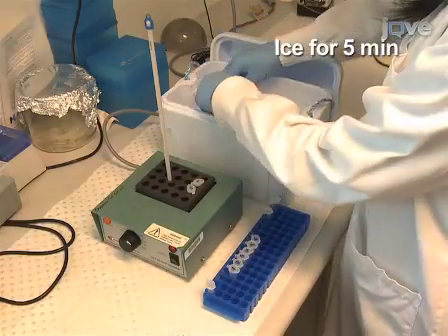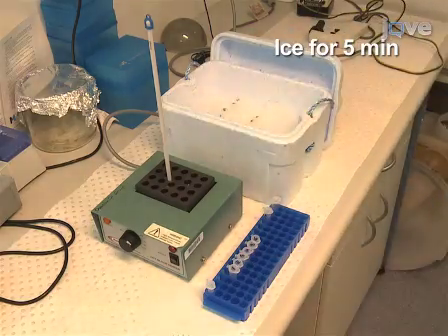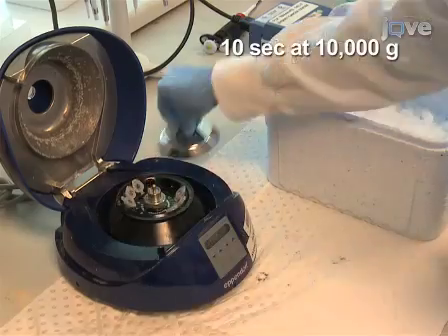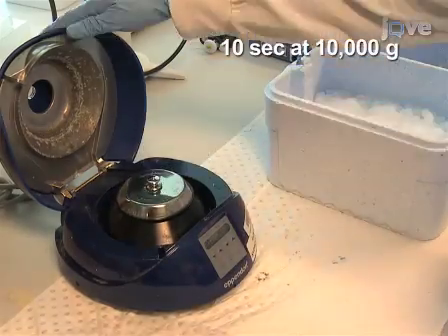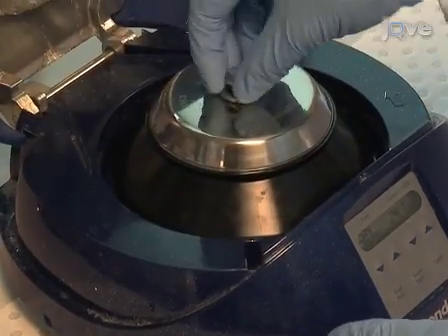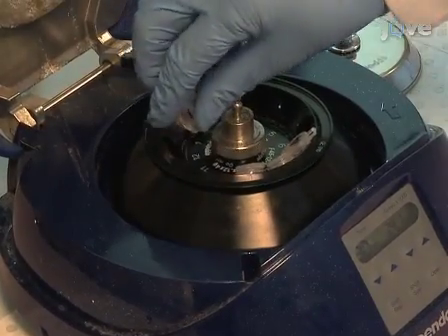Immediately place the tubes on ice for 5 minutes. Centrifuge the tubes for 10 seconds at 10,000 G's to ensure the DNA is at the bottom of the tube. The denatured DNA samples are now ready for bisulphite deamination, which will be demonstrated next.